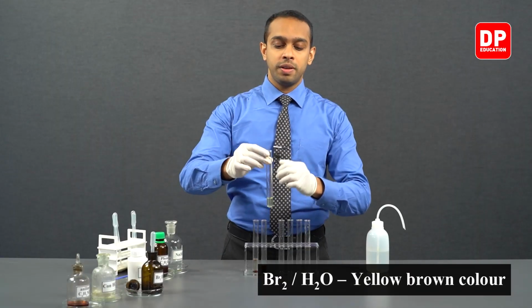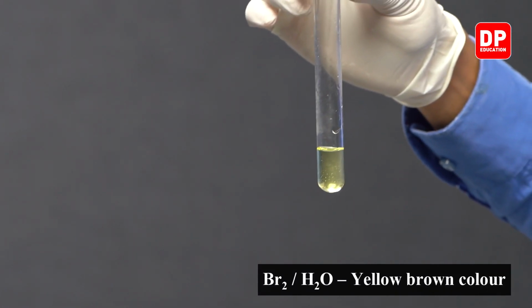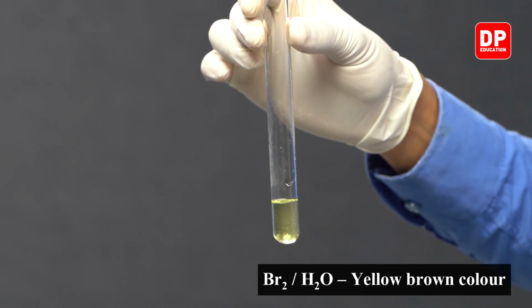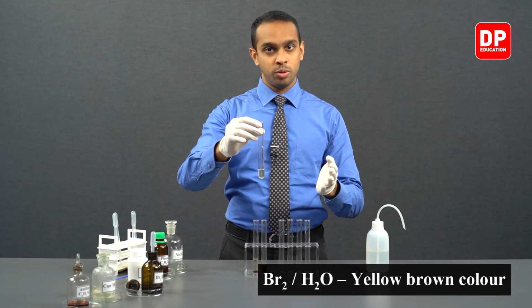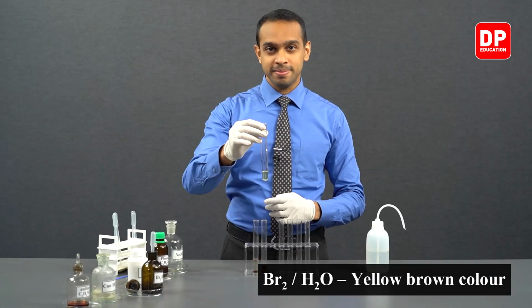The bromine water we have here, as you can see, is a yellow-brown color. Bromine is red-brown in color. So when it comes to bromine water, depending on the concentration, you will have either a very strong yellow-brown color or a bit of a pale yellow-brown color.